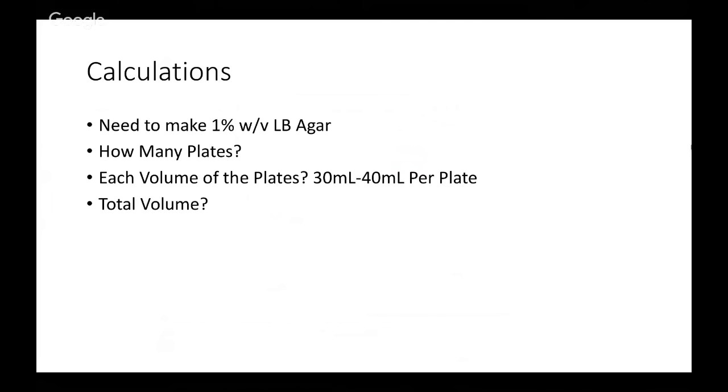What you do is you ask yourself, how many plates do I need for my experiment? And once you figure that out, then you say, okay, about 30 milliliters to 40 milliliters is inside each plate.